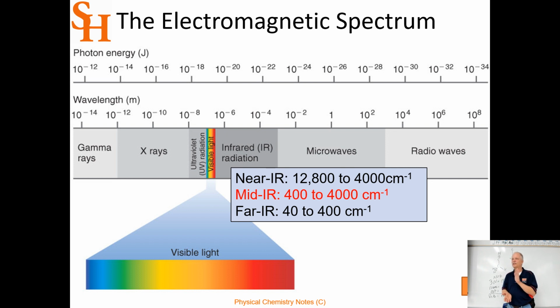Our magnetic fields are really strong, but they're not strong enough to cause those nuclei to split very far. And so the splitting difference is only in the radio wave region. Megahertz: 360 megahertz for our NMR, for our good one, and 60 megahertz for our little, tiny permanent magnet one.